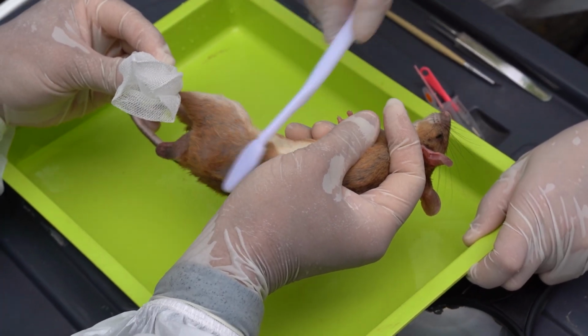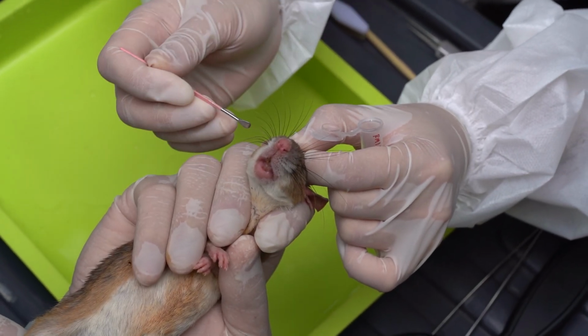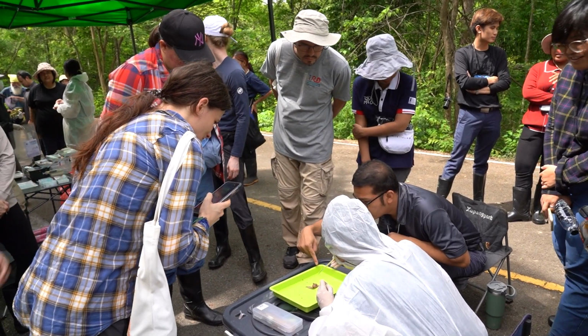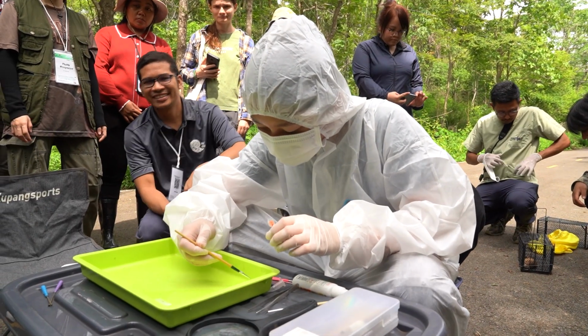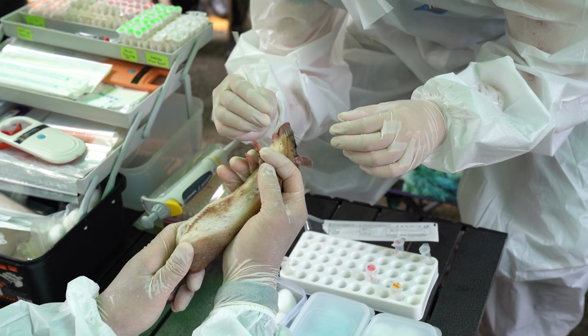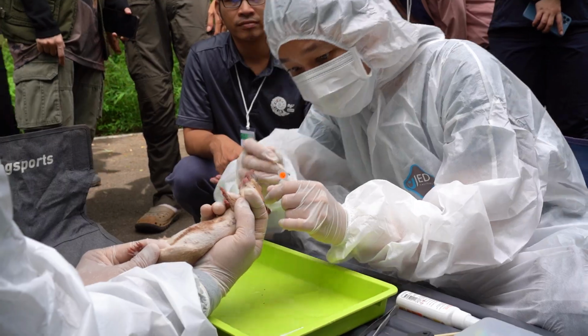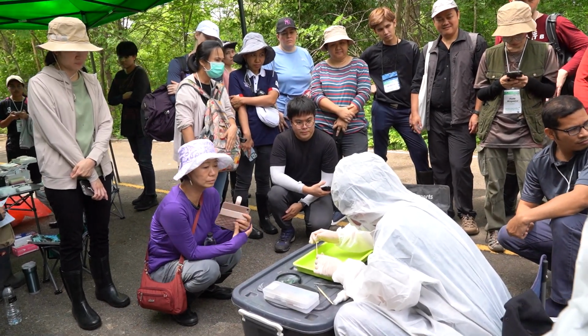As we continue our long-term observatory project sampling different types of samples from rodents, bats and birds, we gather the people in the field who are working on ecology, biodiversity, and disease ecology. And this is a good opportunity to put the laboratory sector, people on genomic studies like nanopore sequencing and next generation sequencing, together with the field sector to work together in a 5-day workshop.